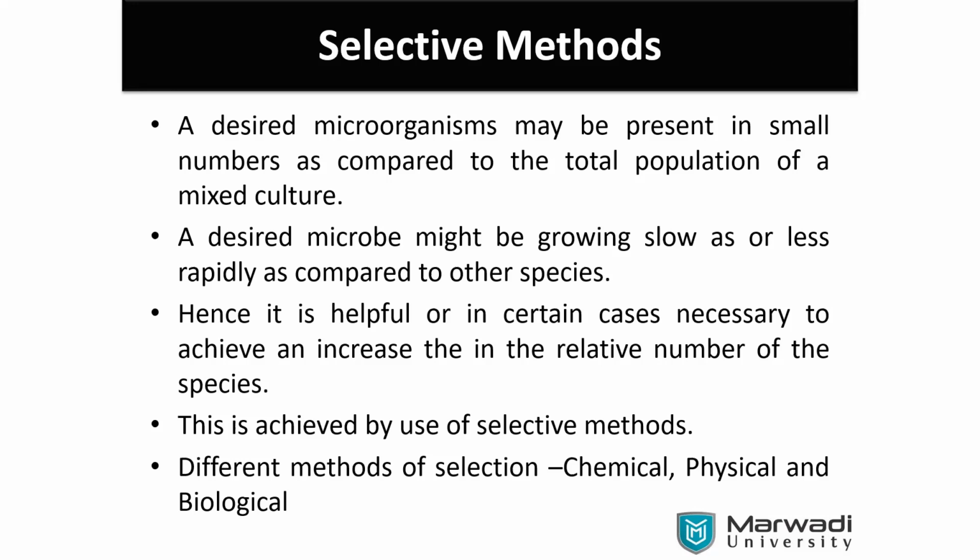So many different plates are there. Just observe them. Some are green. Sometimes you will find that one colony may be growing properly while another is not allowed to grow. There is a chance that this bacteria may release something that does not allow the growth of other bacteria. Just try to observe. Several plates are there.